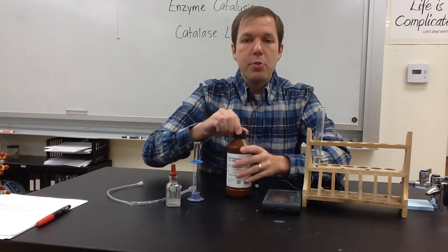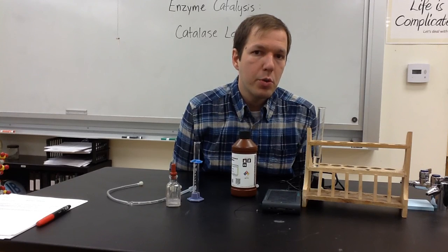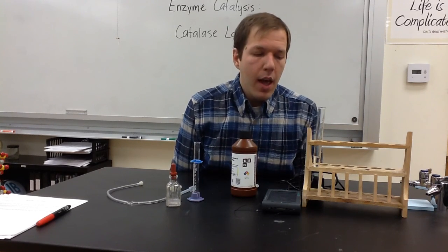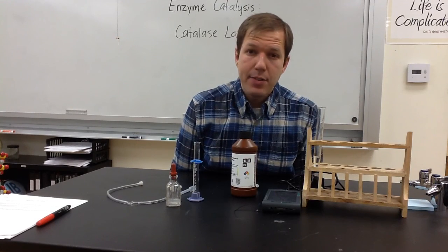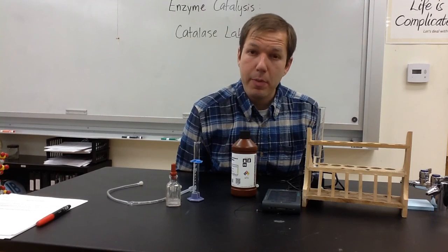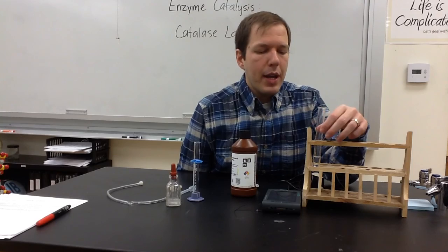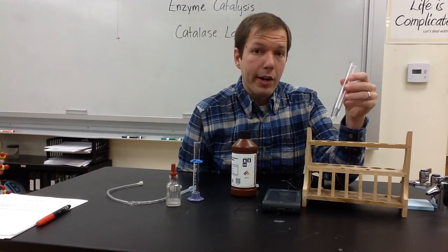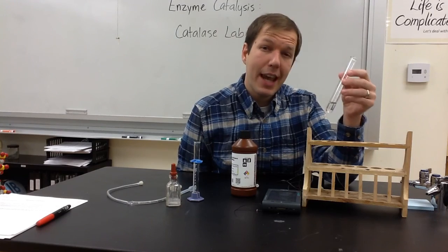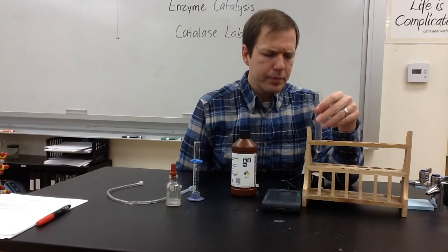Now, in this reaction, peroxide is going to be breaking down into two products. The first product is water, and the second product is oxygen gas. So you're going to get one of the oxygen atoms breaking away from the H2O2 to form oxygen gas, O2. So in that reaction, we're producing water, a liquid, which is not easy to measure, but we are producing oxygen gas, which is easy to measure when we trap that gas in a container.